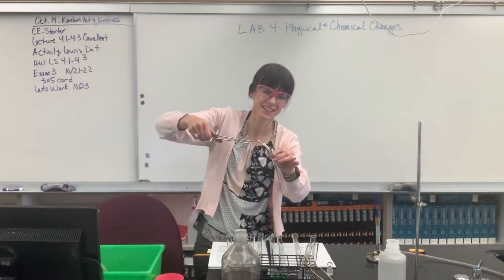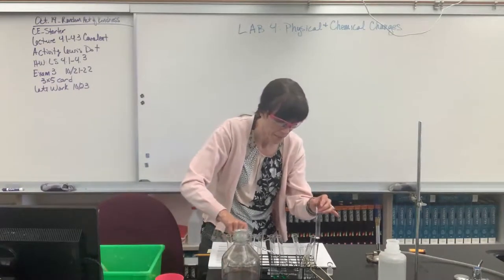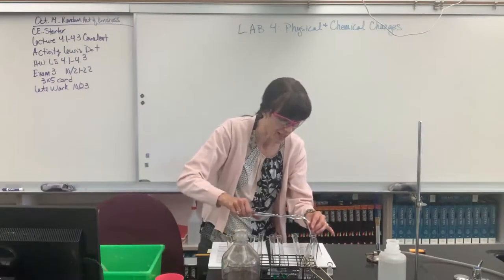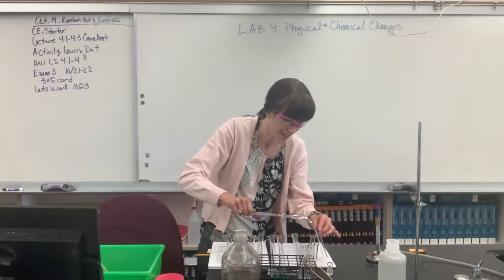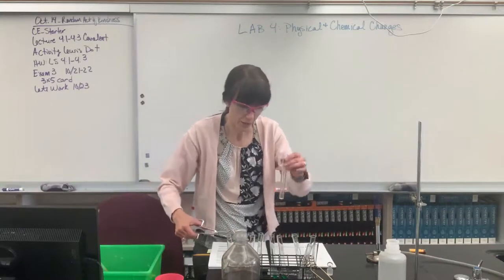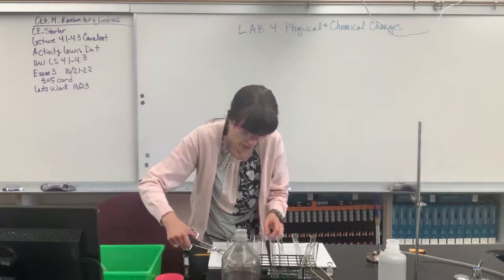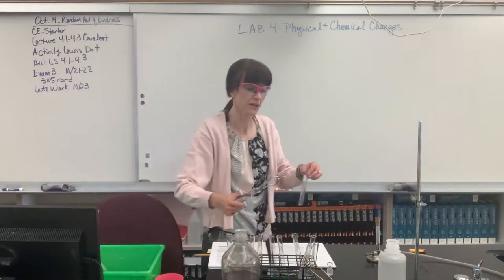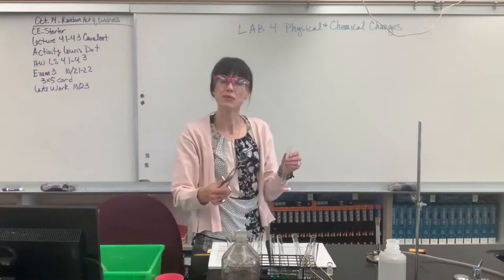take this. This top part didn't burn. I don't want that in there. I should have had the test tube ready to go. Okay. So, in fact, you know what? I'm going to have a little bit that didn't burn. I'm just going to grab this. I'm going to set this on fire, and then I'm going to have the test tube close to put it in.